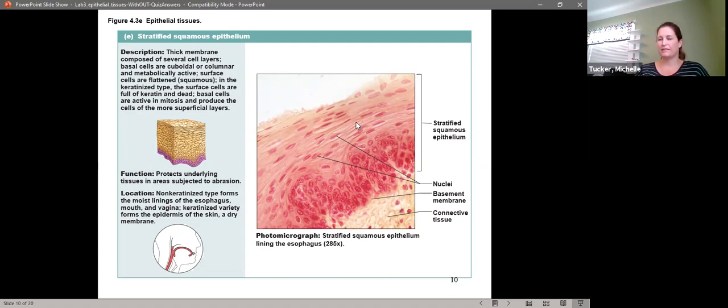The blood supply lies beyond the basement membrane and lies down here. So by increasing that surface area, it allows better diffusion through the multiple layers. So this basement membrane is wavy. That means that this first layer of stratified squamous epithelium is also wavy.